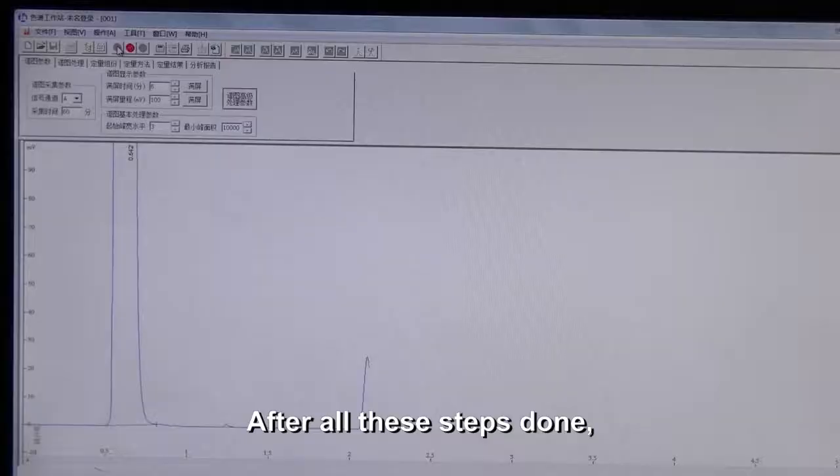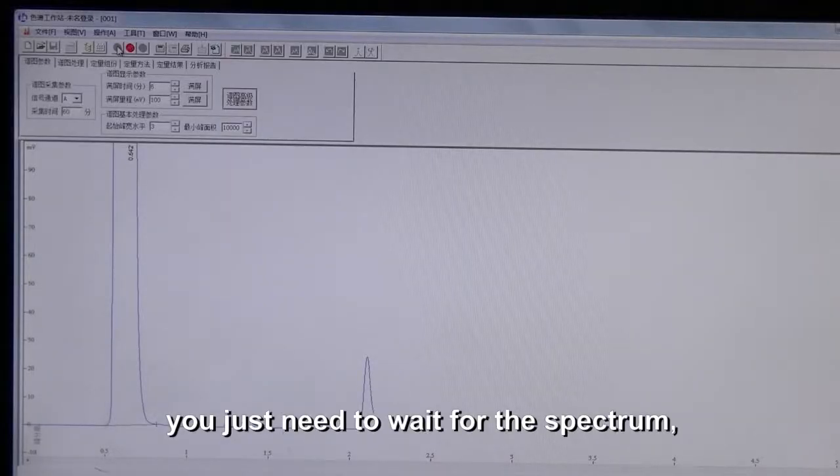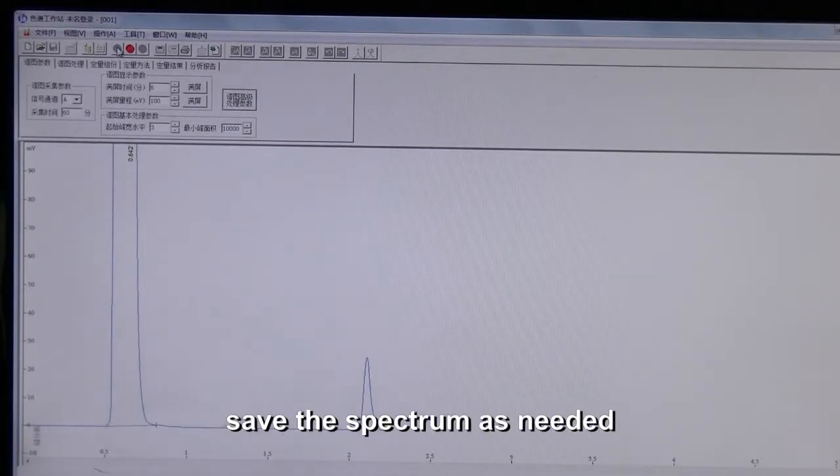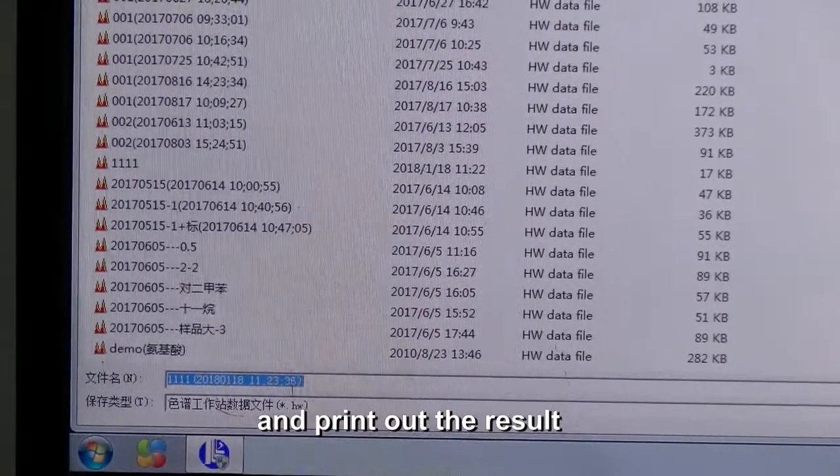After all these steps are done, you just need to wait for the spectrum, save the spectrum as needed, and print out the results.